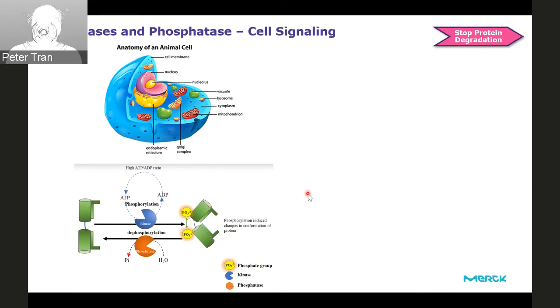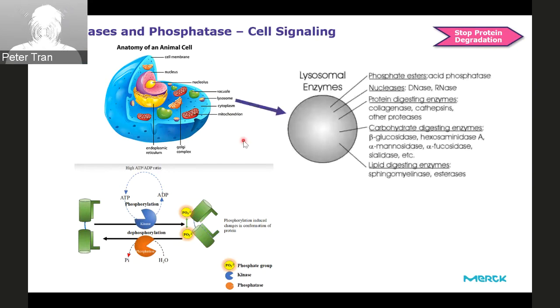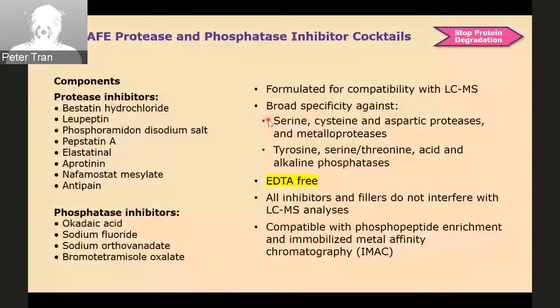or tissues. However, when we lyse the cell, at the same time we also release these proteases and phosphatases into the environment. Especially the lysosome, an organelle within the cells, contains a lot of nuclease, phosphatase, and protease, and your lysis buffer might lyse the lysosome as well and release these enzymes. Then these enzymes will degrade the protein. So that's why it's very important that you have the protease and phosphatase inhibitor in your lysis buffer at a very early stage, just to protect your protein.